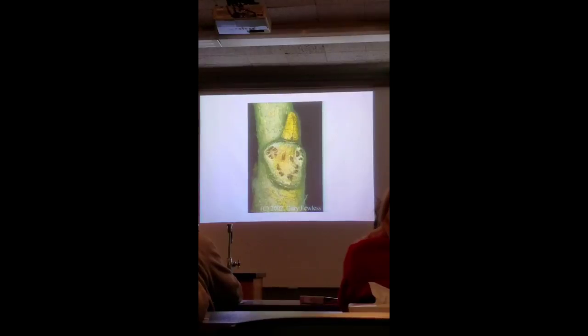Herbaceous. Is this a root, stem, or leaf? Monocot or dicot? Dicot. Does anybody know of a woody monocot? So the answer is dicot. Yeah, Daisy. You said root, stem, or leaf. The whole structure we're looking at is a stem.